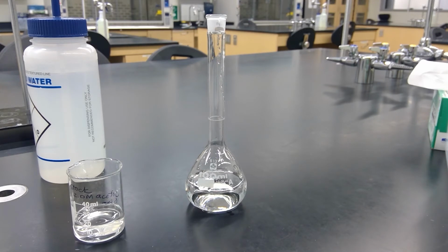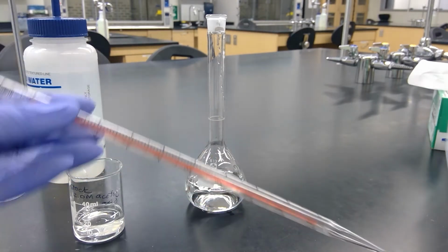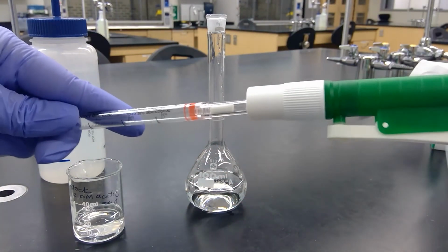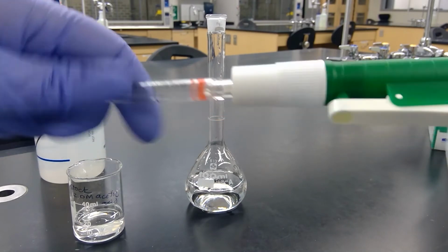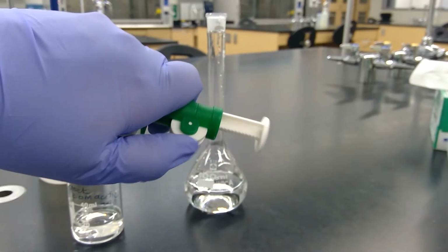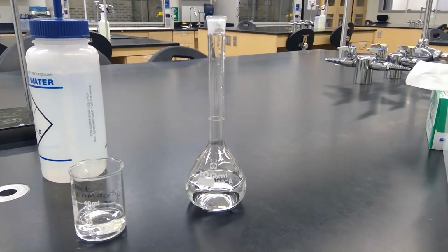Alright, so to prepare the 0.10 molar acetic acid, use a pipette pump to pipette the required volume of 2.0 molar acetic acid into your volumetric flask using a pipette and a pipette pump. So to do this, you just attach it, and then to use the pump, you roll it to draw up liquid.